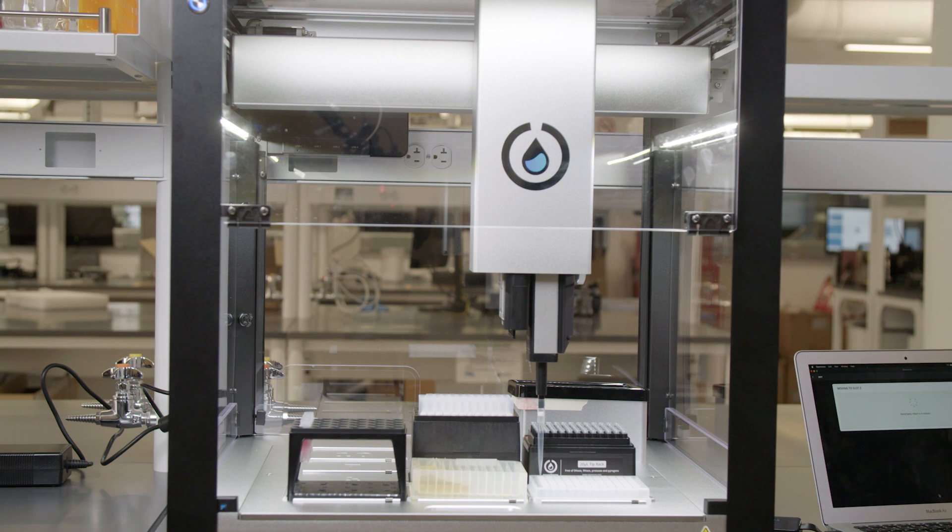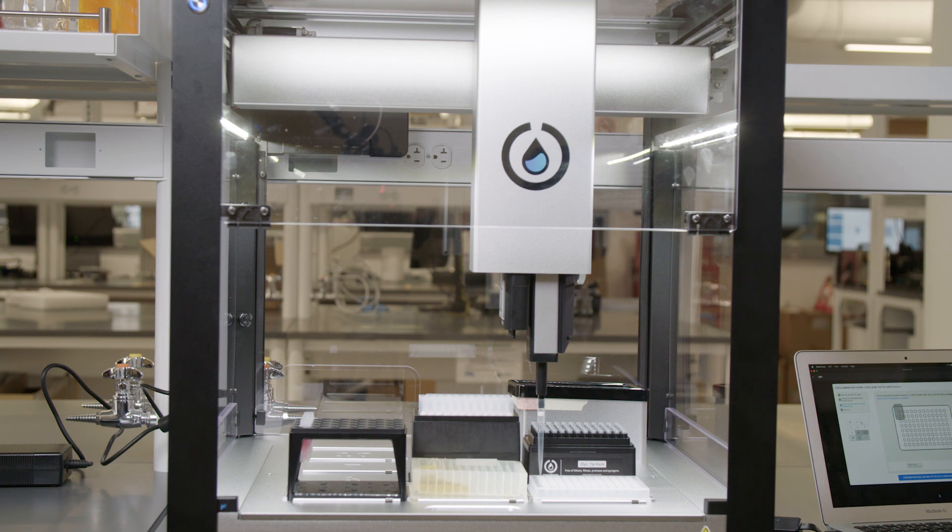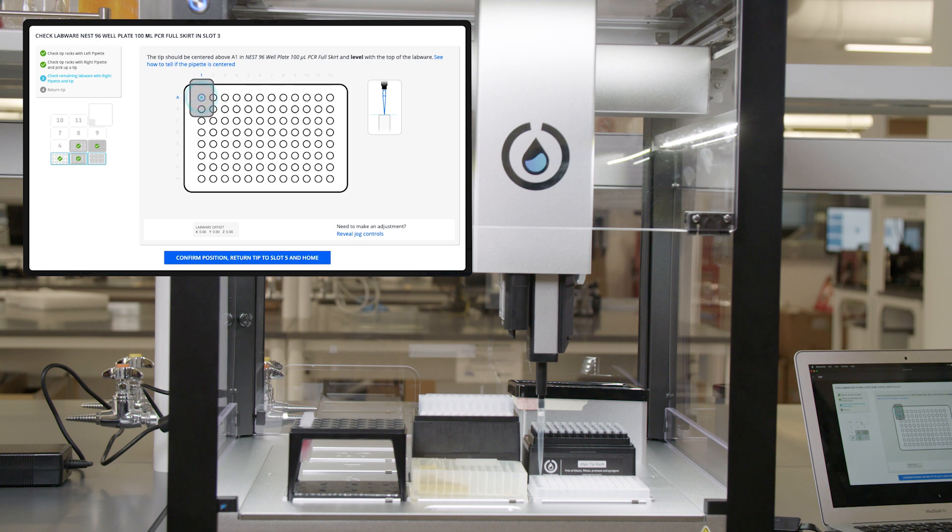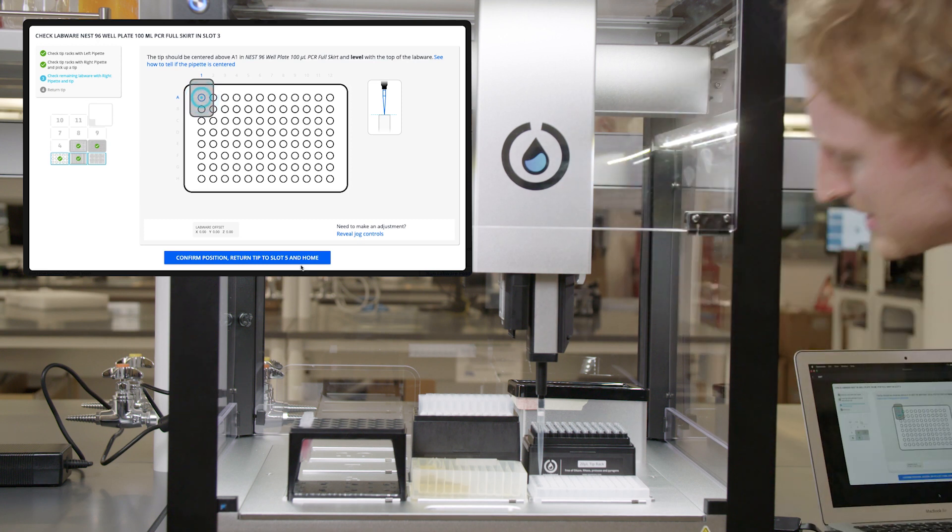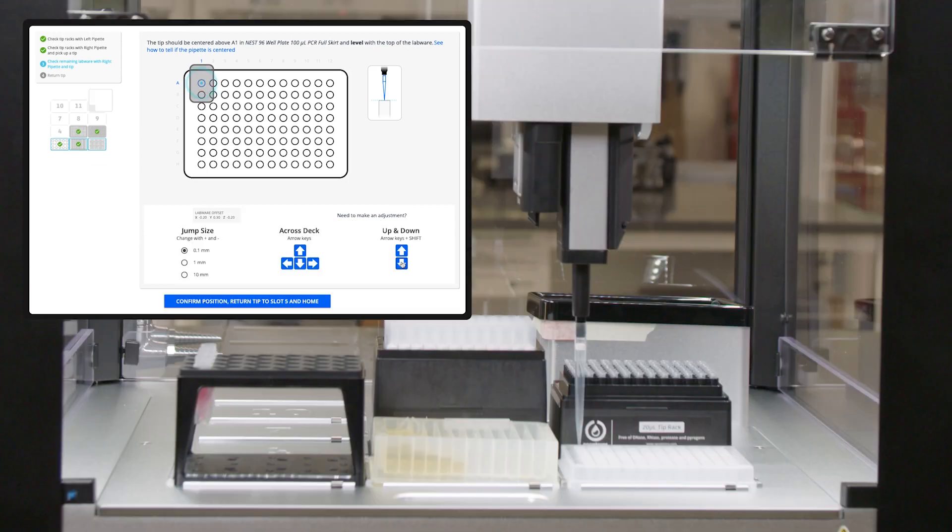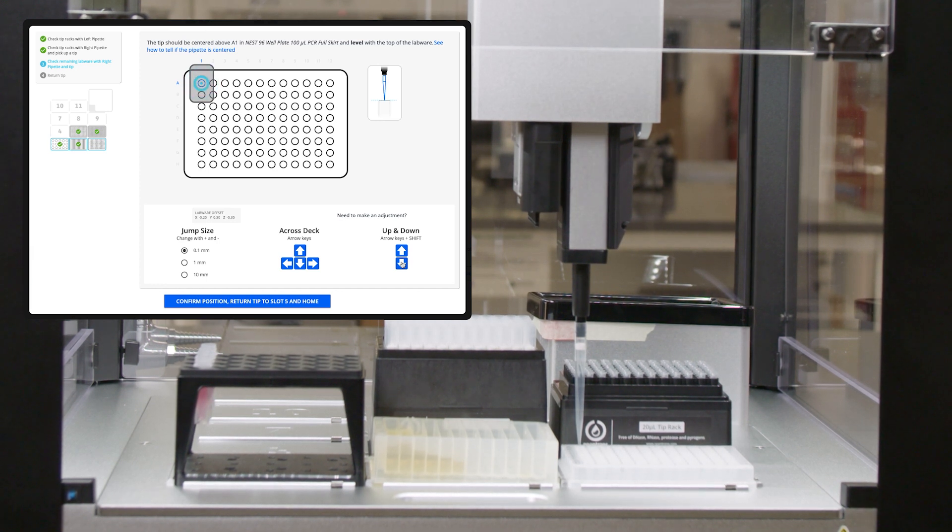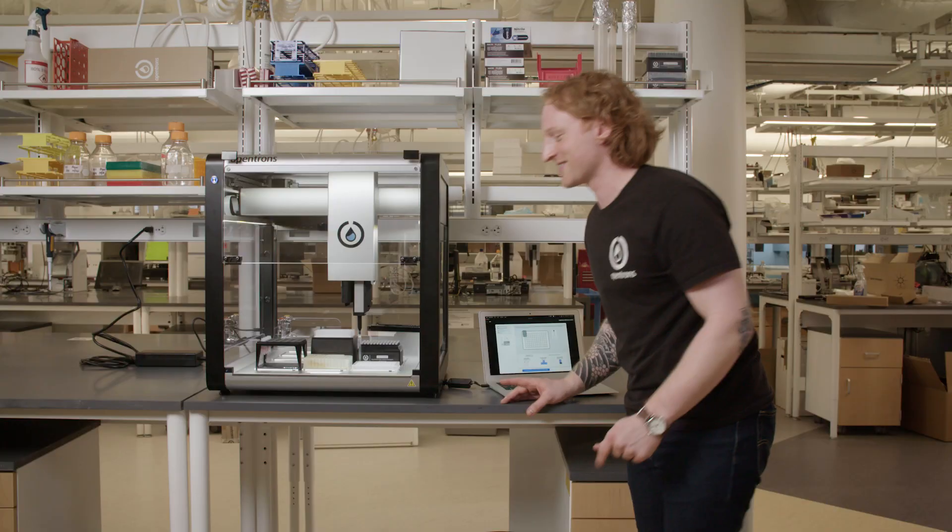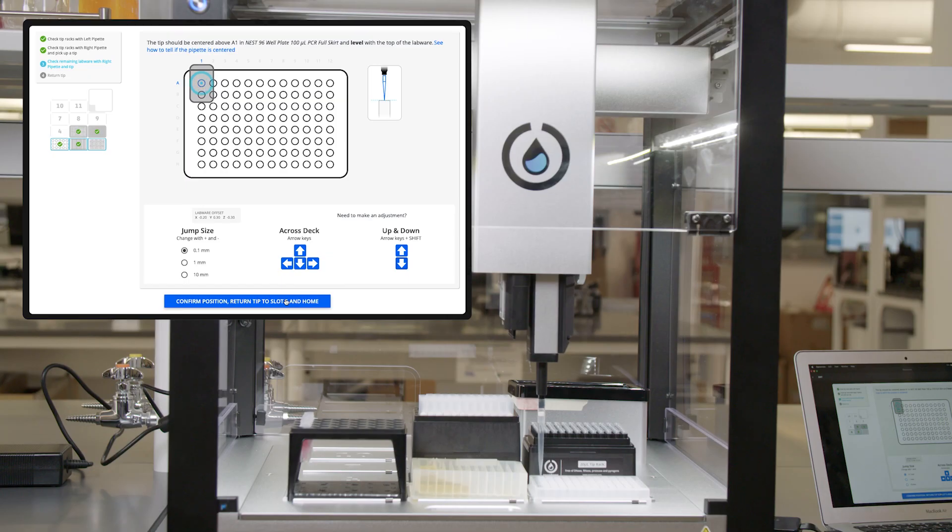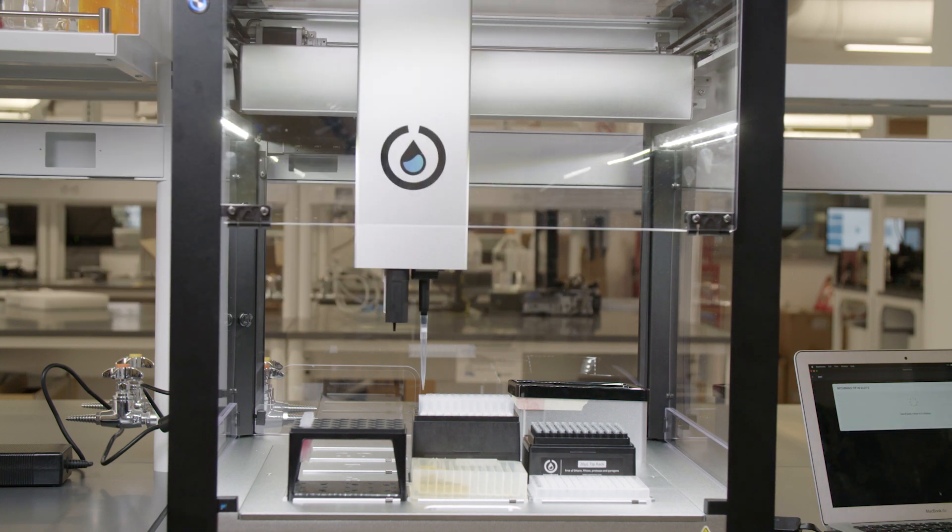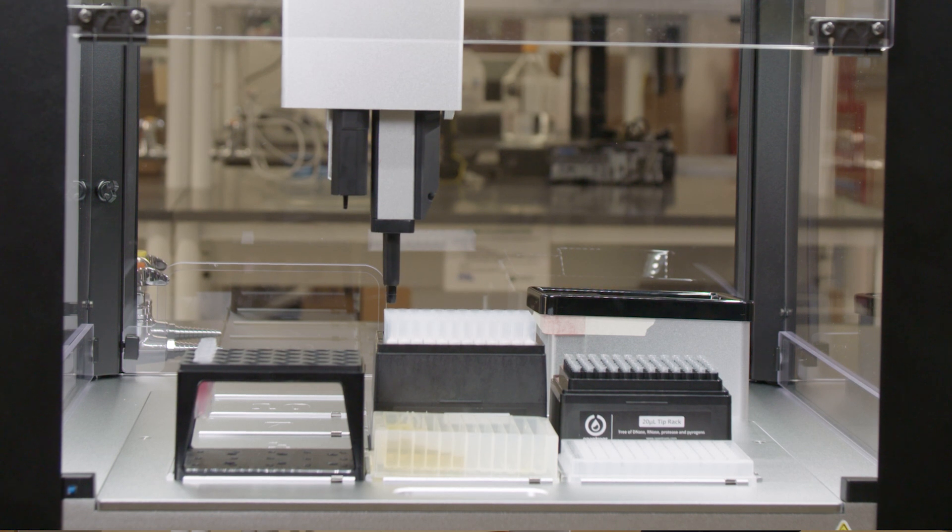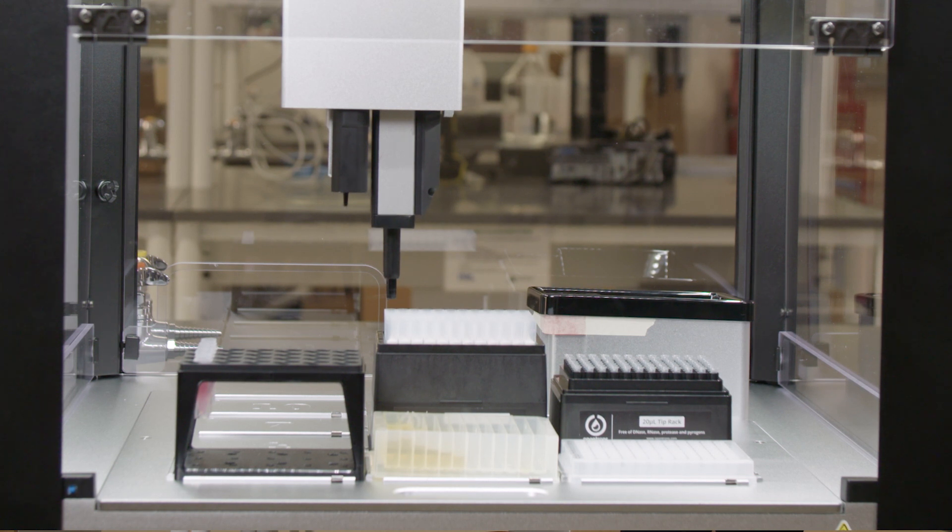Just like the previous two pieces of labware, it will move to well A1, and I need to make sure that the tip is centered in well A1, and the bottom of the tip is even with the top of the well. It's pretty good, but I think it could be a little better. So I'm going to reveal jog controls and jog it a little bit. Now that's a great calibration. So I will confirm the position and the robot's going to return the tip into the tip rack in slot five. It's going to drop the tip and the robot will home.